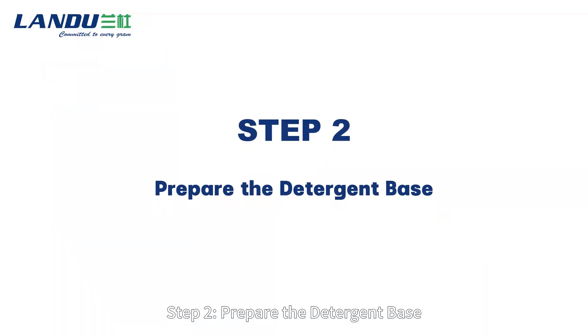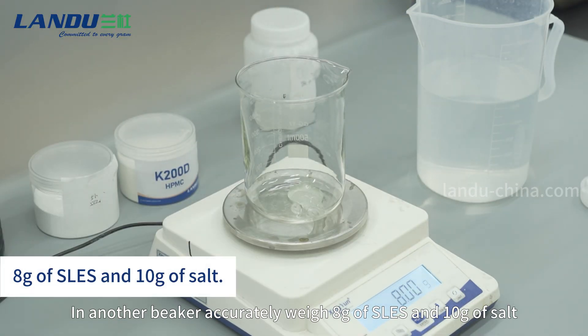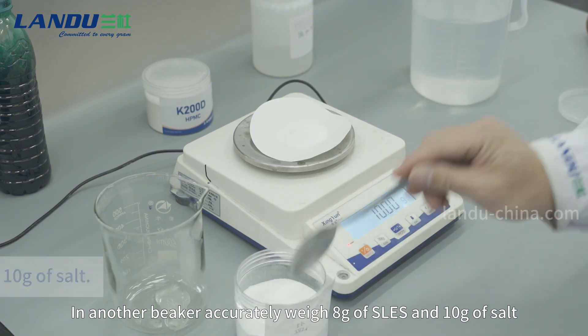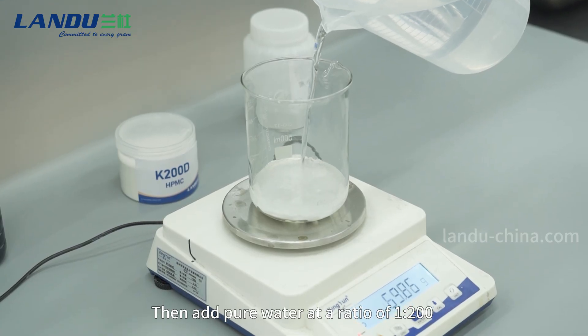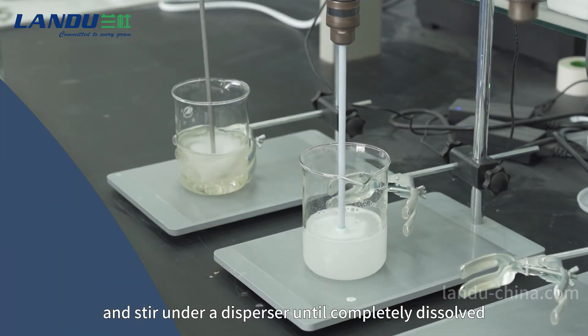Step 2: Prepare the detergent base. In another beaker, accurately weigh 8g of SLES and 10g of salt. Then add pure water at a ratio of 1:200 and stir under a disperser until completely dissolved.